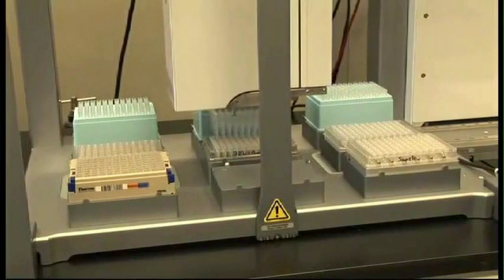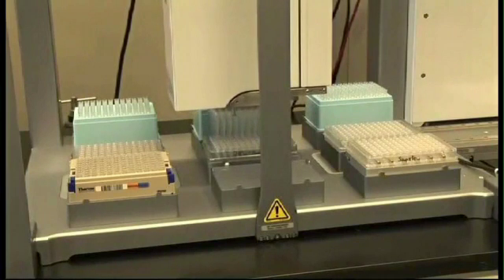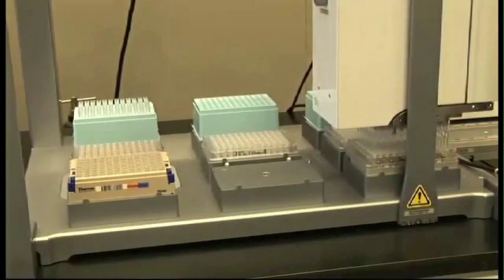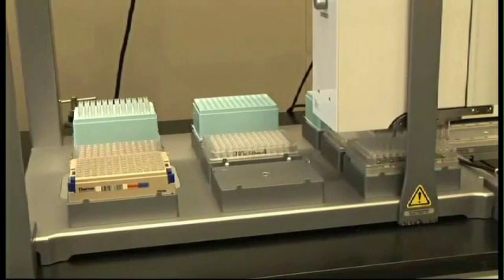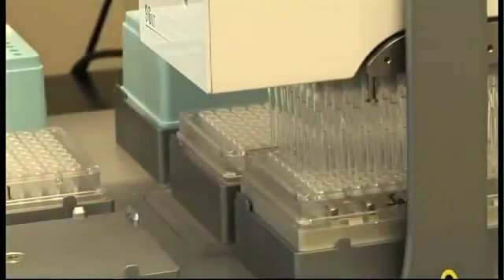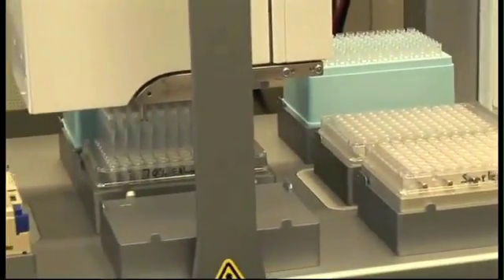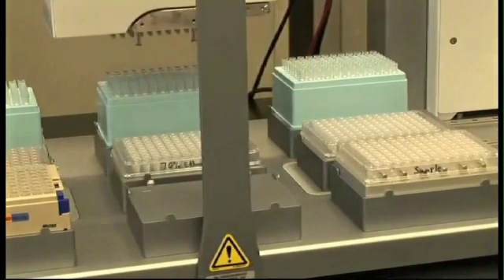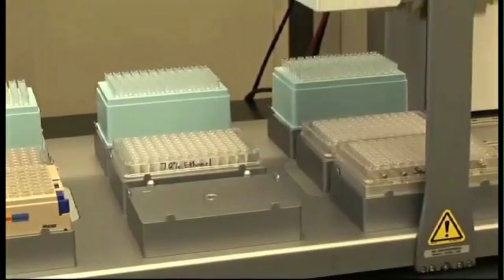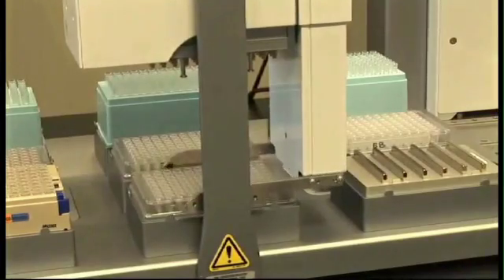Next, the beads which are still stuck to the sides of the well are washed with 100 µL of 70% ethanol to remove any residual waste that may still be in the wells. The ethanol used to wash the sample is then aspirated from the sample plate and dispensed back into the plate that used to contain the clean 70% ethanol. After completing the ethanol wash, the plate is moved off the magnet and back to position 8 to allow any residual ethanol to evaporate at room temperature for 6 minutes.